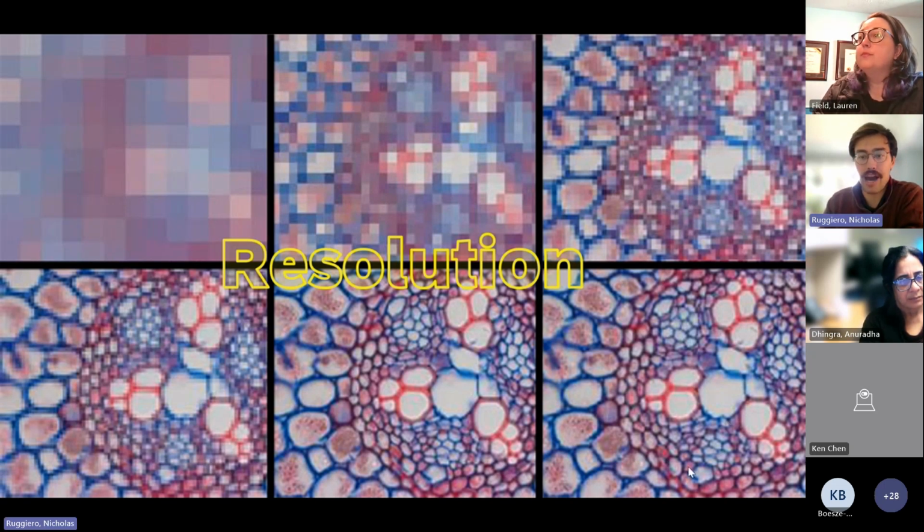Aside from point scanning confocal, where we can change the size of our pixel and our zoom, we're going to just want to go up in magnification, making sure that we can see our features of interest, and maybe do some stitching if we need to. The only other way to do that would be to look at the camera that we're using. Camera technology has come a long way in the past couple of years with the invention of CMOS cameras and cameras that have much smaller pixels. So we can get some improvements there as well.